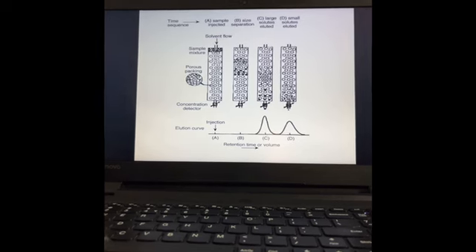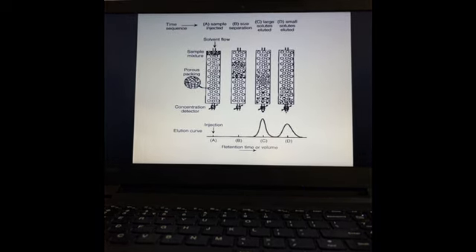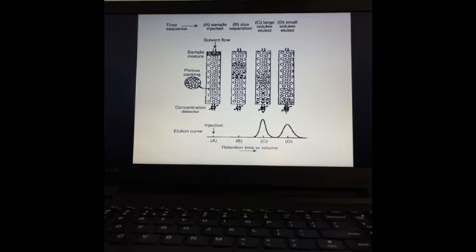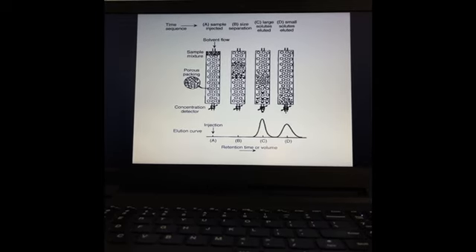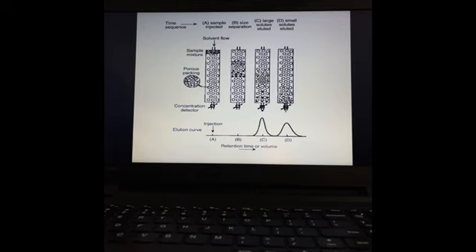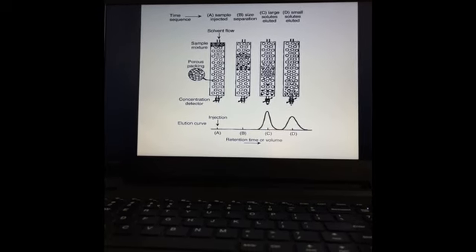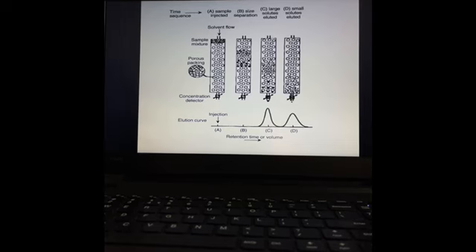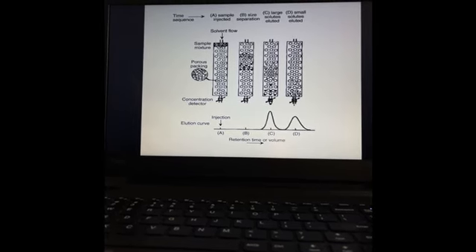Assume this chromatographic column is a liquid or gas column. It is an aluminium or any other column. The column is filled with a packing material that is going to be the stationary phase. This stationary phase is porous in nature. We can see the porous packing here, and it is spherical in shape. This porous material should not be responsible for any unwanted adsorption of the solute molecules while they are moving through the column.